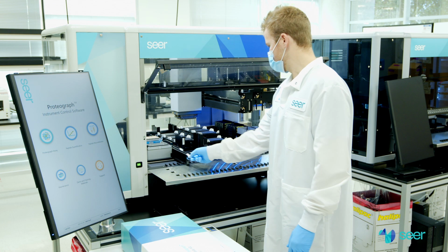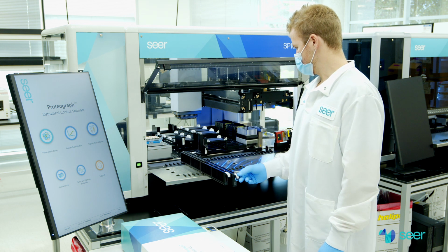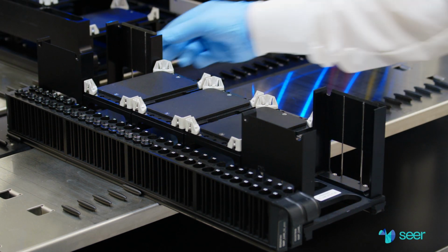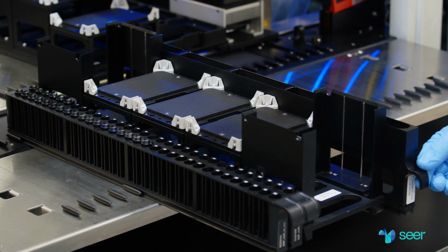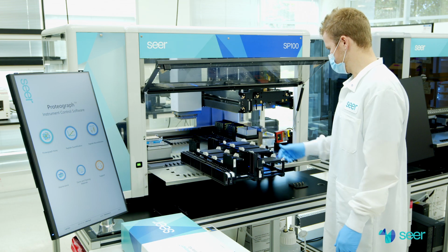The SP100 has been successfully initialized and we're ready to load the work deck. Ensure the 6 carriers are pulled forward from the SP100 work deck to the autoload tray. Ensure the carriers are pushed back until they touch the stop hooks on the far side of the autoload tray. You should hear a click when they are in the correct position.